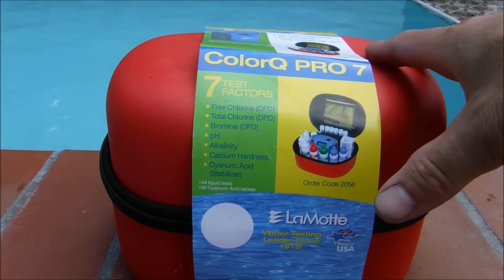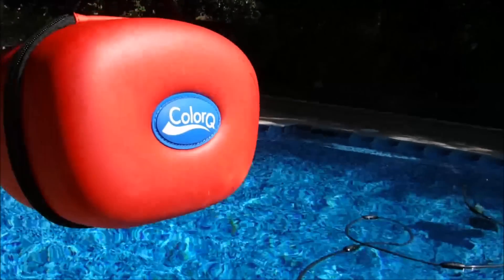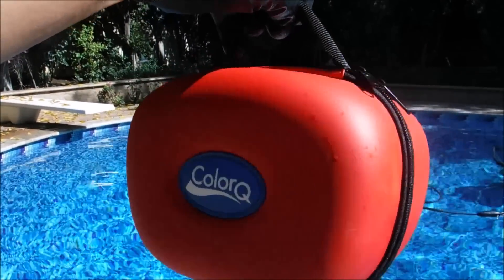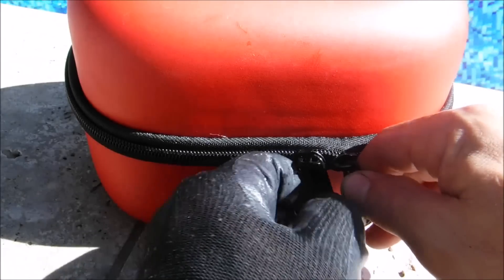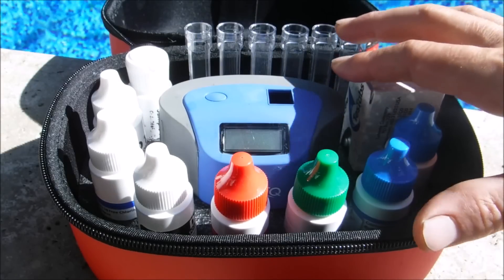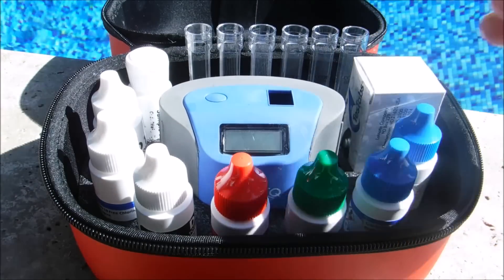I'm going to show you the ColorQ Pro 7 by LaMotte. The ColorQ comes in this really nice case with a handle. It's a water-resistant case with a convenient double zipper. If you're a homeowner looking for an accurate test kit, the ColorQ would be a solid investment for you.